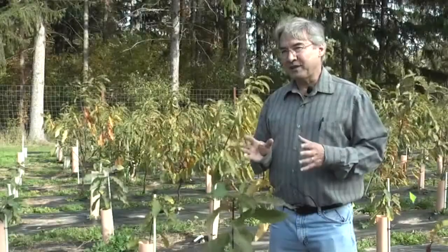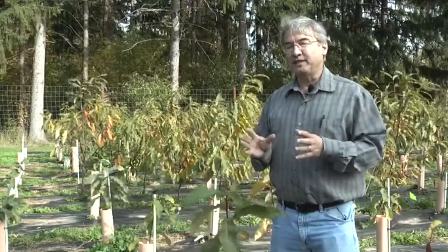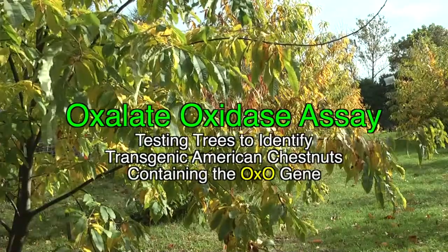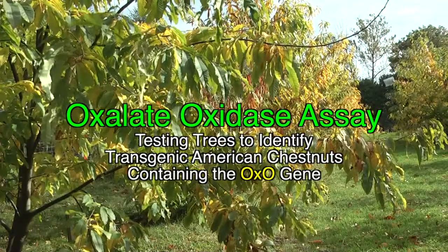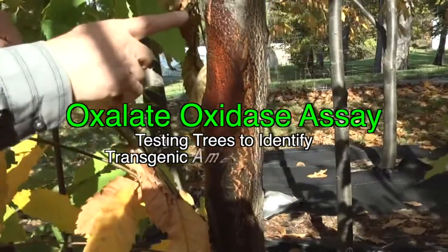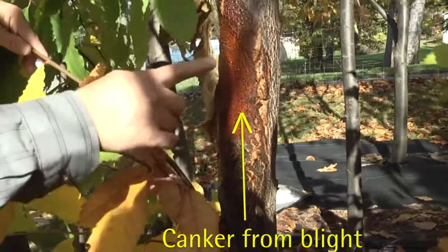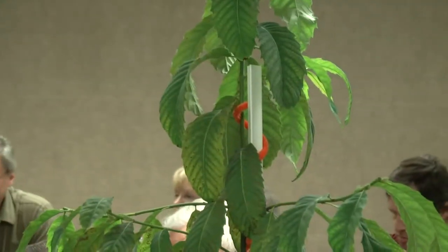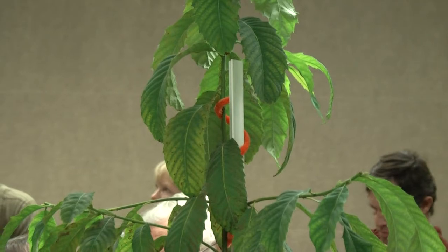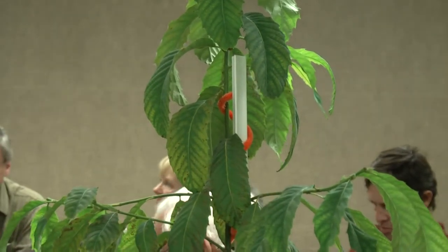The really neat thing about the enzyme that we put into this tree is it is one that people eat all the time. It's called oxalate oxidase, and it sounds kind of strange, but it actually comes from wheat. The neat thing about this enzyme is that it detoxifies an acid that the fungus that attacks the tree makes. So today we're doing an oxalate oxidase assay, which will help determine whether or not a tree specifically is a transgenic tree, one of our transgenic trees.